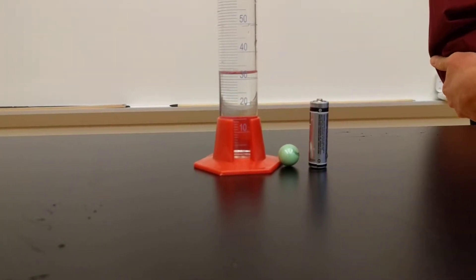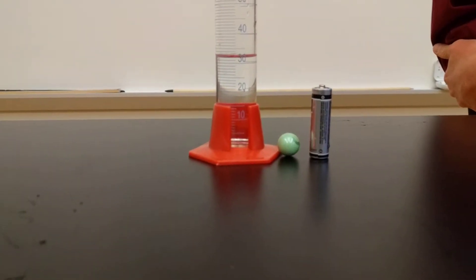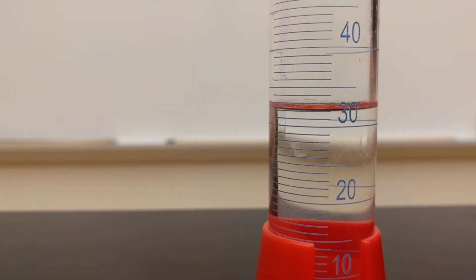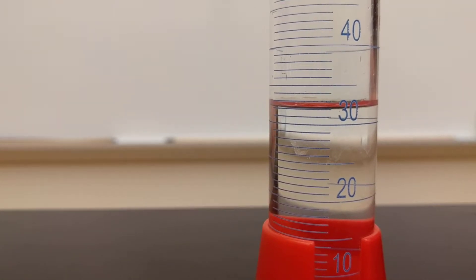So in this case, we're going to take our initial reading, and our initial reading, you're going to get eye level, and it looks to be about 32 milliliters. So you write down your initial.